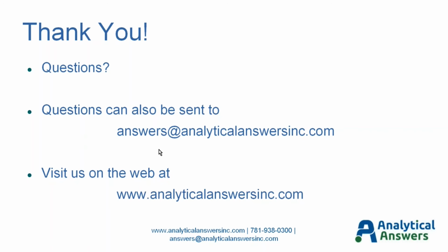Can you do grain boundary imaging and analysis in the TEM? Typically the answer to that question is yes. Again, it can be somewhat sample dependent, so if you have a problem along those lines, I would certainly encourage you to get in touch with us and we can see about designing an analysis to address that. Can you do grain or particle size analyses from TEM images? Again, the answer to that in general is yes.